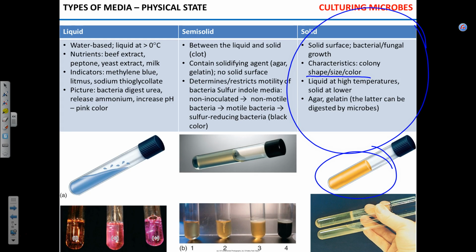as you just did with your hand washing. How many types of colonies were we able to identify? Mainly two, white and yellow. In some cases we had this big yellow, big white, right? And you had a red one, yes. So actually it comes down to four. Okay, four different types of colonies. And they were quite different, right?